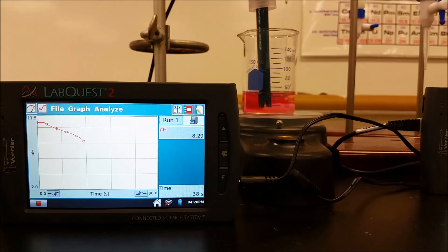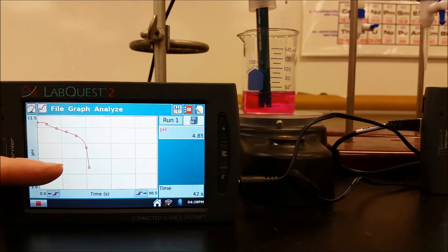So now you can see that we're starting to get a color change and there's our color change right there. And you can see that we're at the point where we're at our equivalence point, we're getting that large slope. And so therefore, our endpoint and equivalence point are close together.